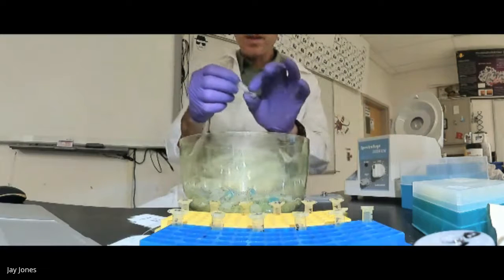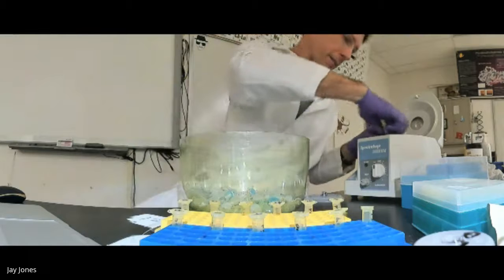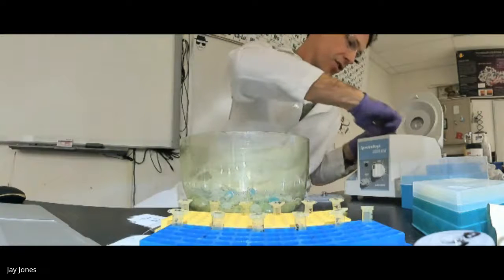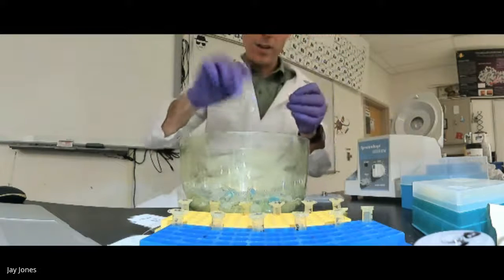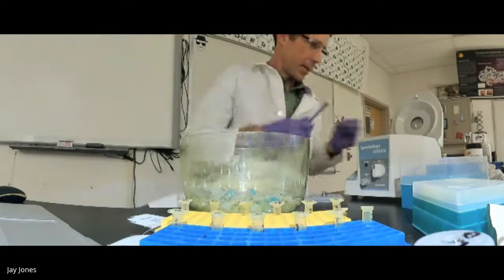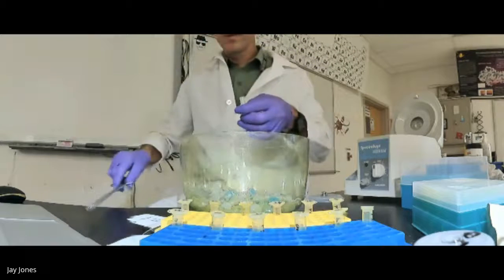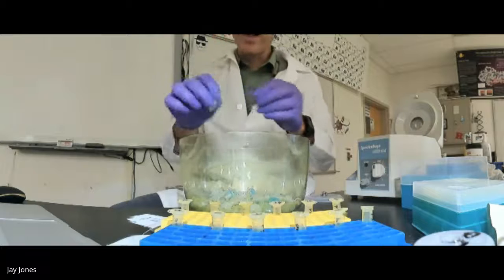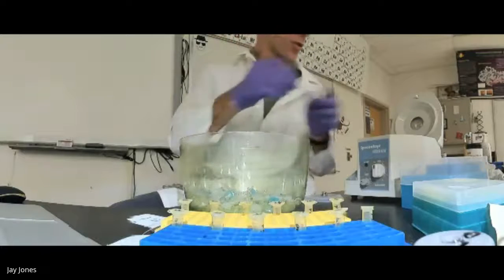I'm going to pull them out. You see that liquid right there? That's the ethanol that came through. Dump that out, and I'm going to put it right back in. And so this is an insurance step, because I'm going to spin it again just to make sure. Oh God, this is hard to get out. Just to make sure I get all of the ethanol out. I have to get that ethanol out. I need a tool here. This is just too tough. See, I'm looking at the collection tube and I'm dumping all that ethanol. I don't want the ethanol. I want the column, but I'm making sure all the ethanol flowed through.